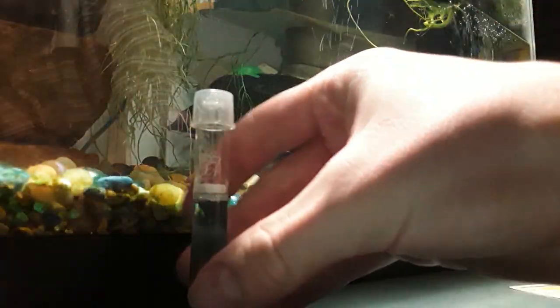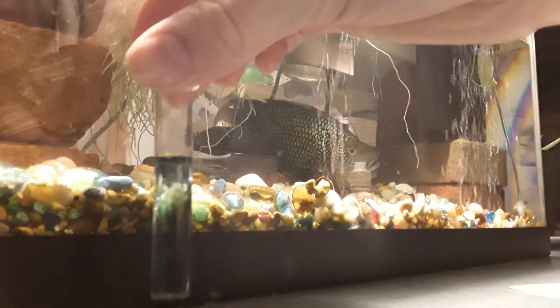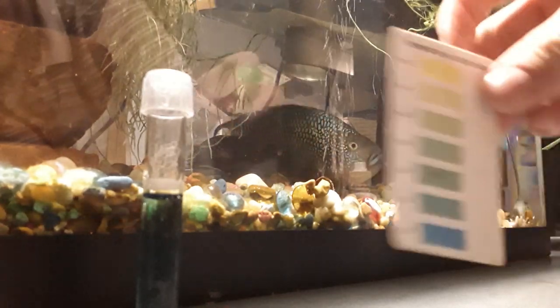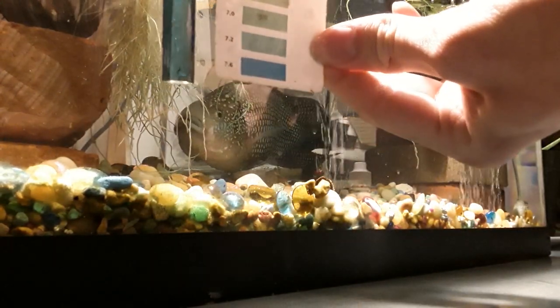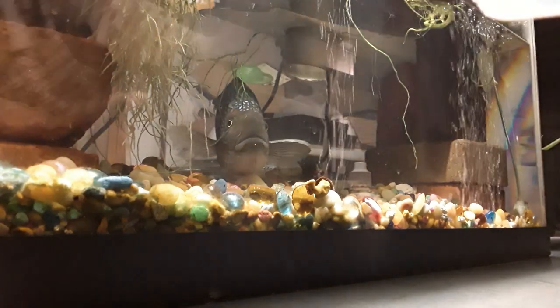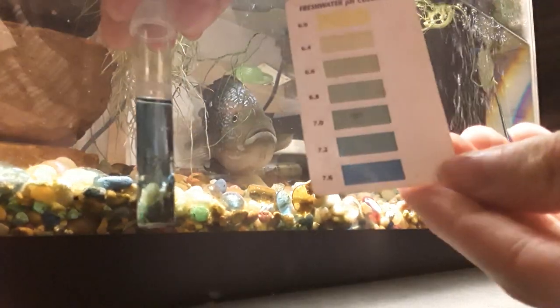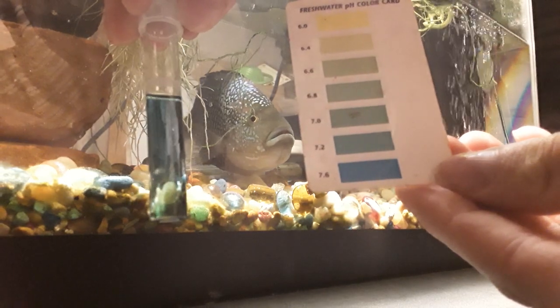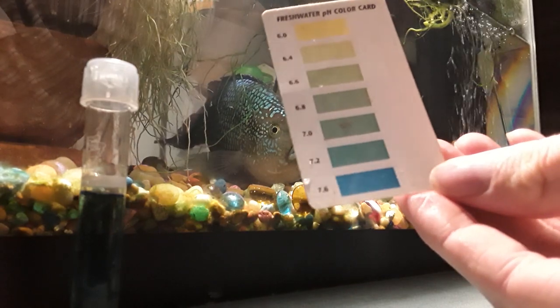You see it turned into a bluish color. I'm going to put it up to my color chart and get some light through it so you can see. It is around the 7.4 range. That's pretty close to neutral. That's fine.